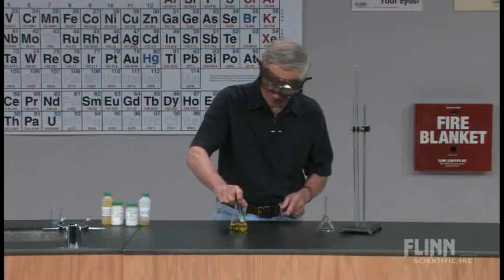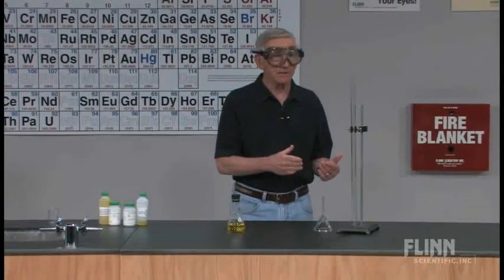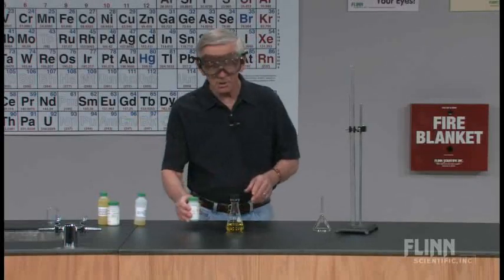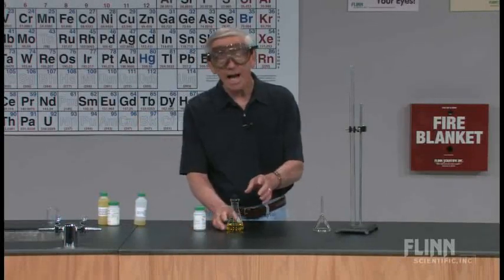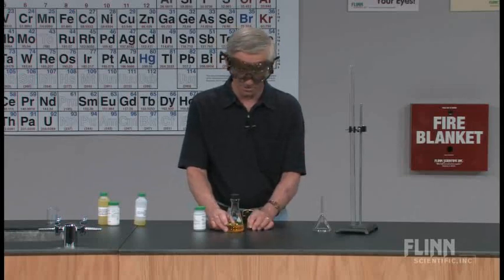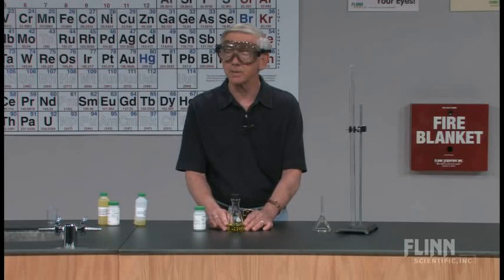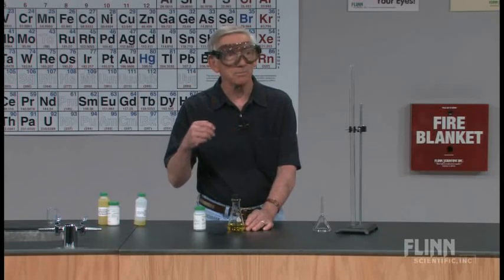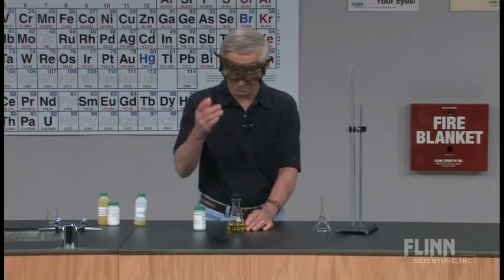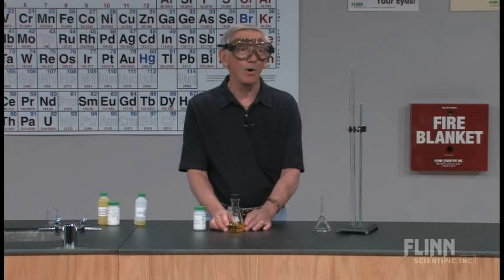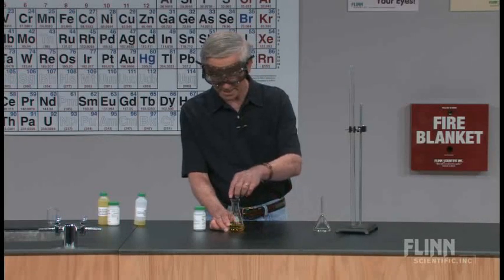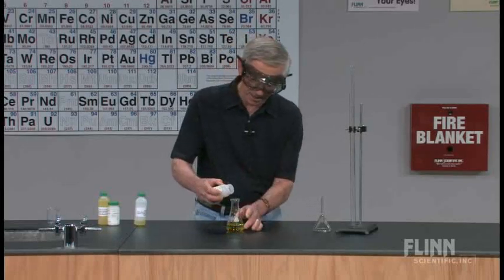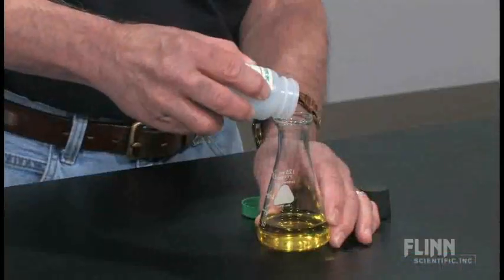What I want to do is convert some of the vanadium 5 to other oxidation states. And to do that, I'm going to put some metallic zinc in. I used to do this with a zinc amalgam from an article I saw in J. Chem. Ed., but that's zinc and mercury. And as Larry Flynn was telling us, mercury is now out. You just can't have it. Well, if I put just zinc in here, I can still get a nice reduction product.